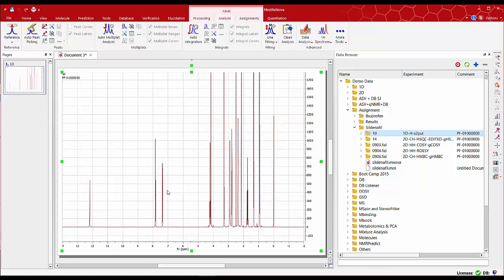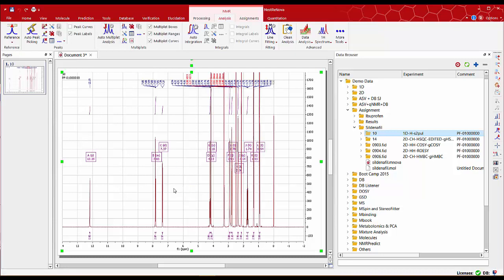Now click auto multiplet analysis to carry out peak picking, integration, and multiplet analysis all in one go.